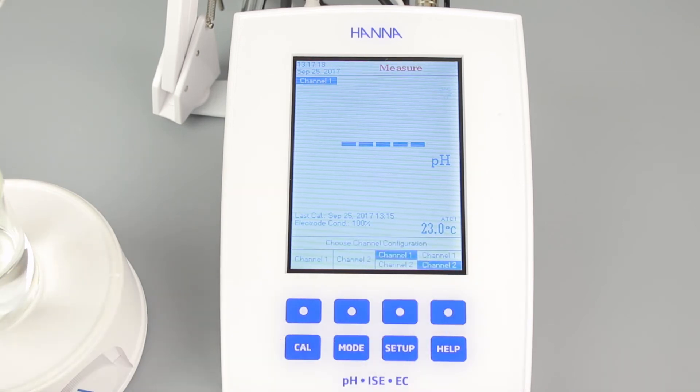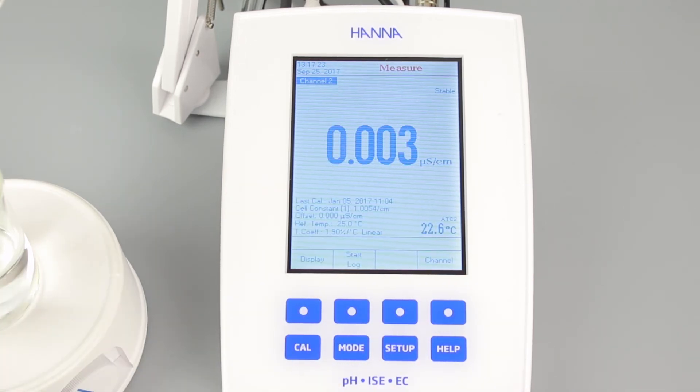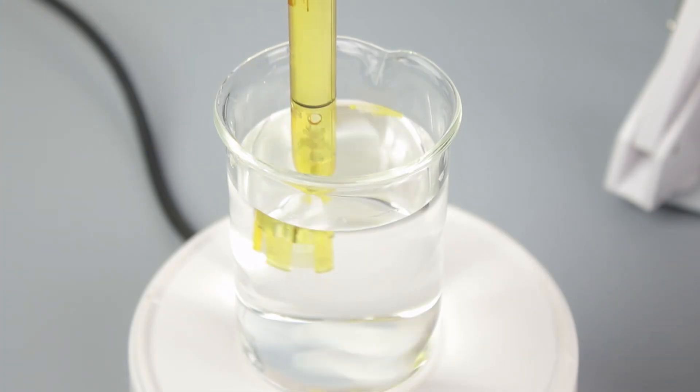To perform a conductivity calibration, access the EC channel by pressing channel, then pressing channel 2. Now, press CAL to enter EC calibration mode. Submerge the EC probe in the standard of your choice. Be sure to rinse with standard before submerging the probe for best results. Once stable, press accept and then escape to save the calibration.